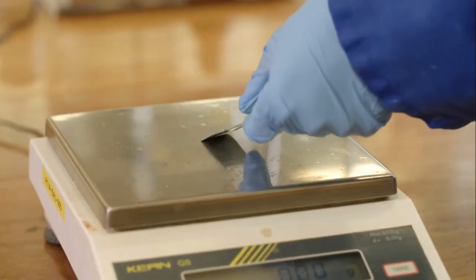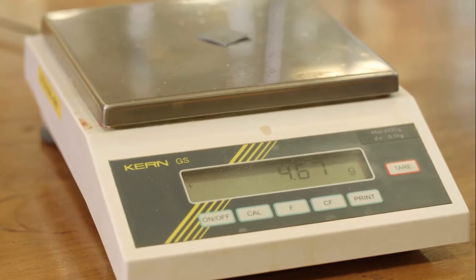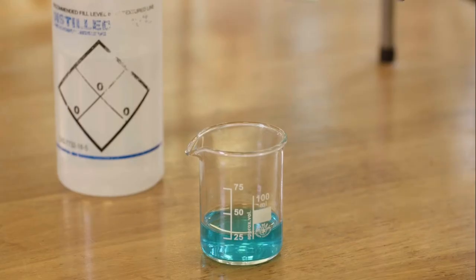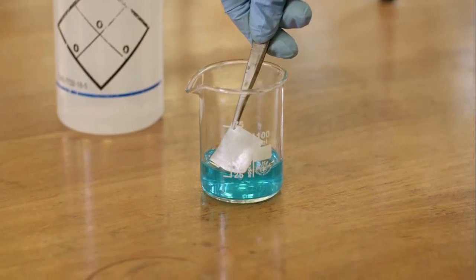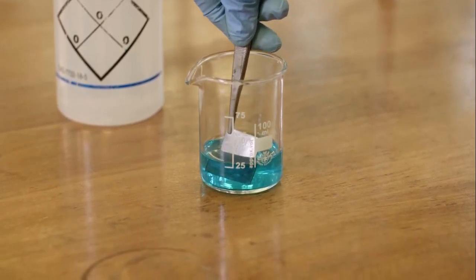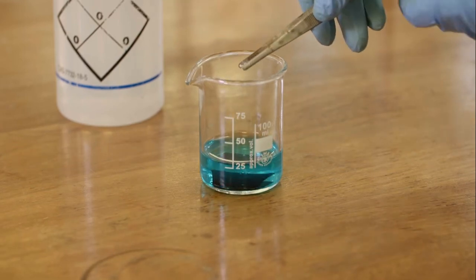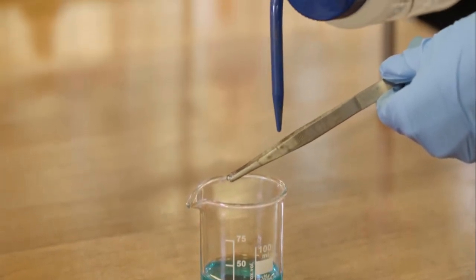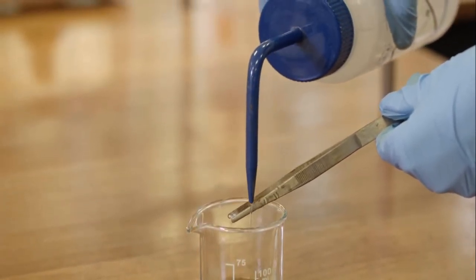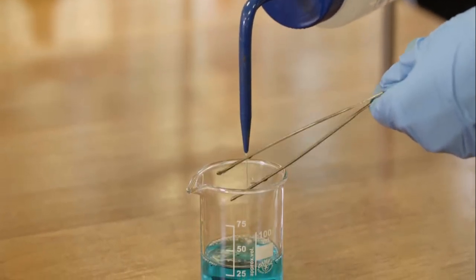The mass of a zinc piece is recorded and, using tweezers, is carefully added to the beaker. The zinc is used to displace the copper in the reaction. At this point, the tweezers are rinsed with distilled water into the beaker. This is to ensure that you don't remove any copper ions from the solution with the tweezers.